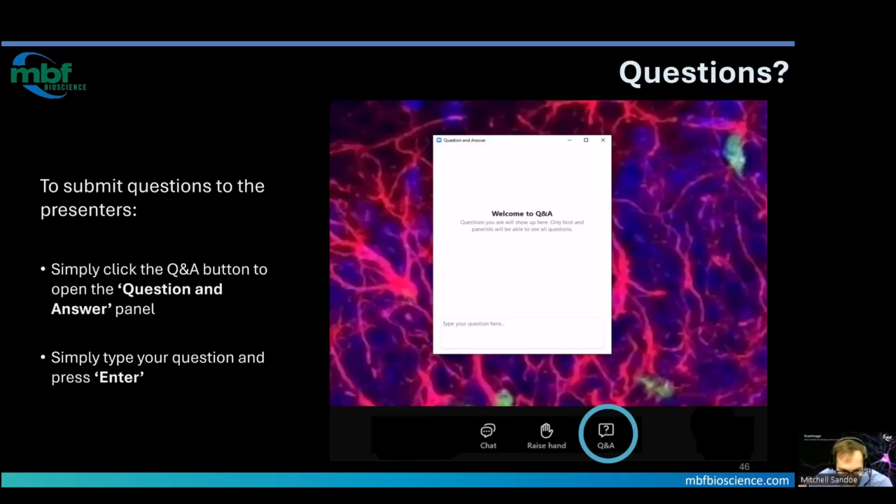I see one question is, how does one view multiple images from temporally binned virtual channels? Yeah, there's the color mixing, but if you don't want your channels to be mixed in color, you can add multiple viewports.